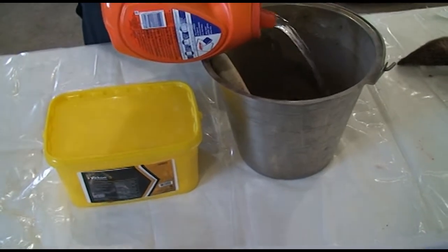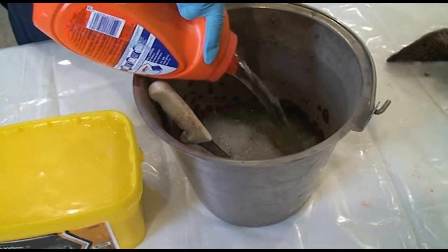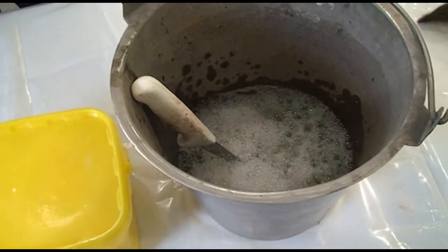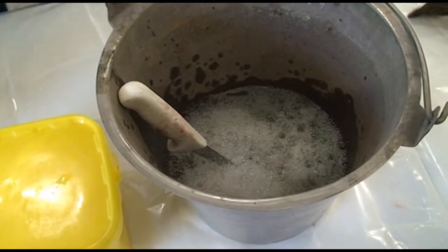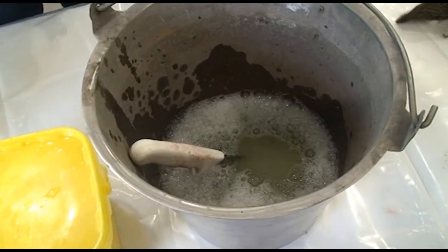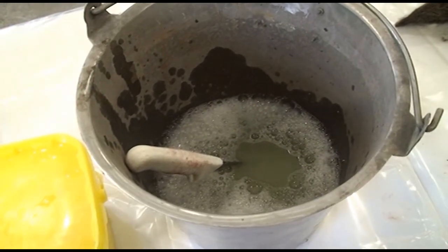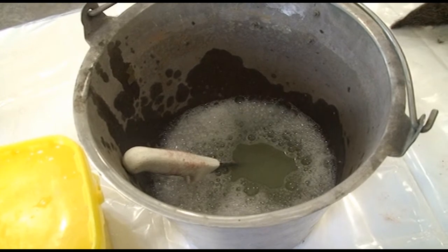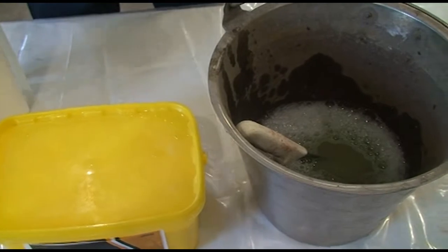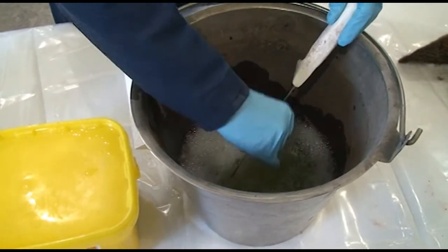So we pour water here into our bucket. We've got Virkon that we put in there, Virkon powder. And then we'll clean up our equipment with that. And the main thing that we need to do is make sure you dry it really well after you clean it with some paper towel, because especially with the bleach or any of it, you don't want to leave the liquid sitting on the equipment, because it will rust the stainless steel.